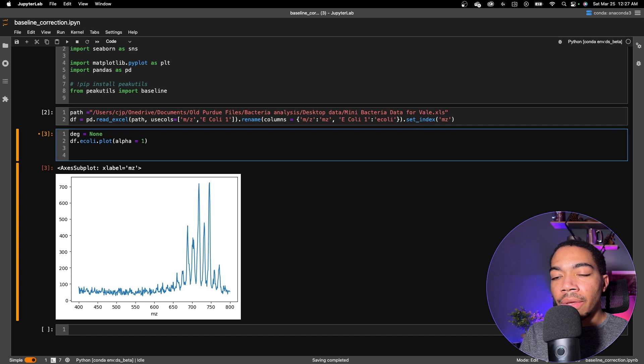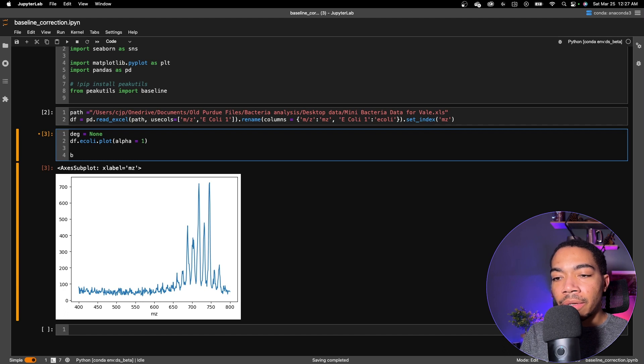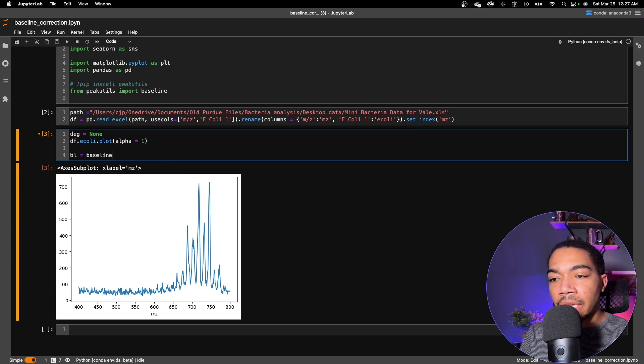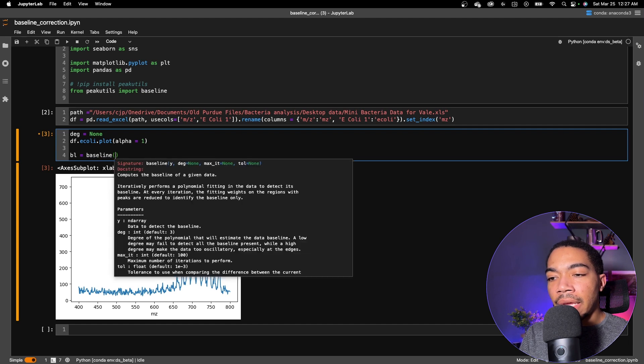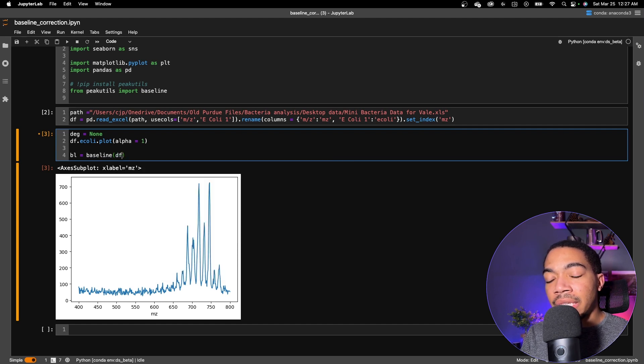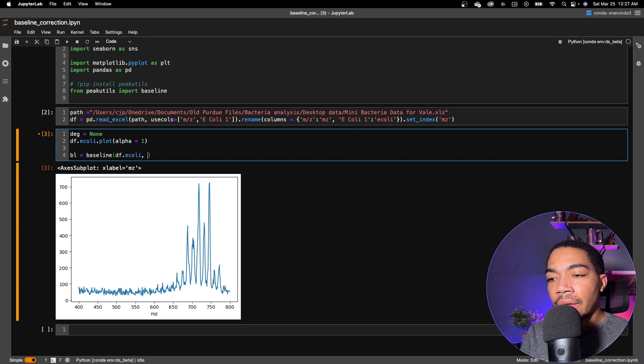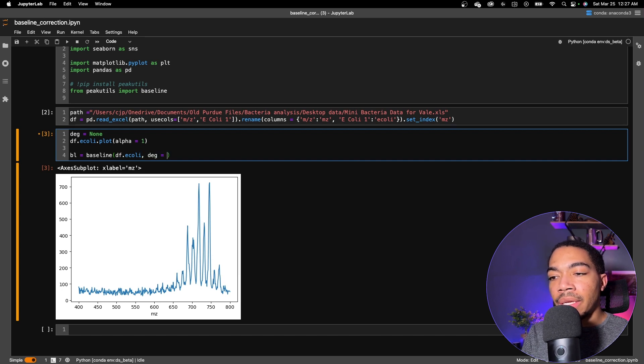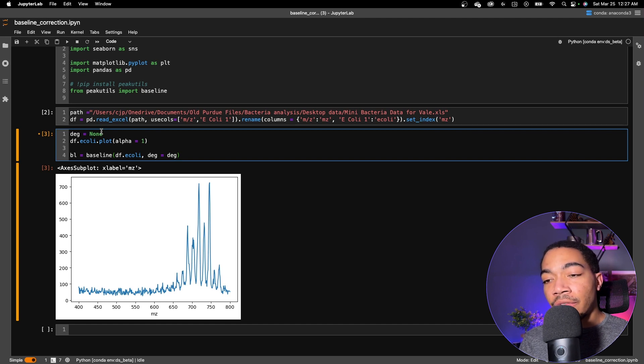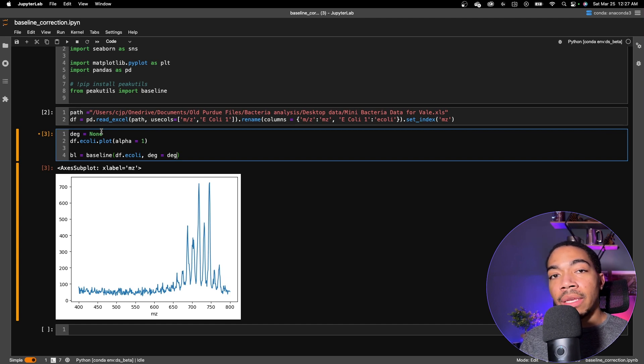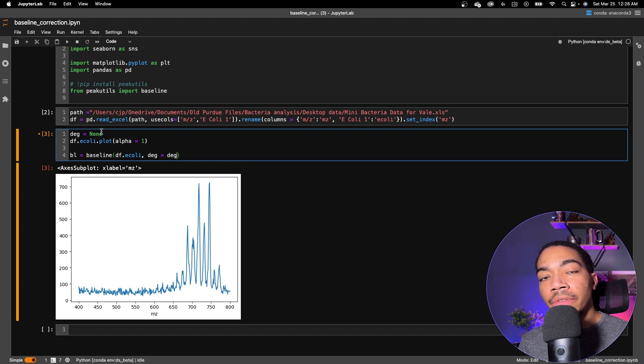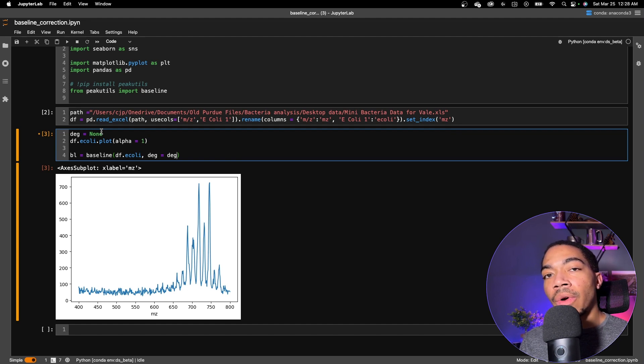So the first thing I want to do is compute the baseline. I'm going to make a new variable called BL. That'll be our baseline. And we're going to pass in the baseline method. And again, it takes a y parameter. In our case, it'll be df.e_coli, and then the degree would be degree. Like I did in the peak picking video, I want to show you what the default parameters are and how we can look to see if we are fitting closer to an optimal fit or if we're far away.